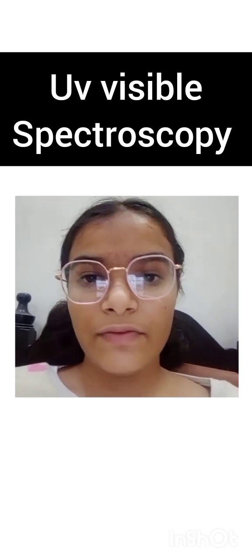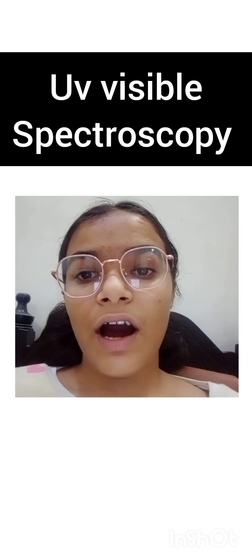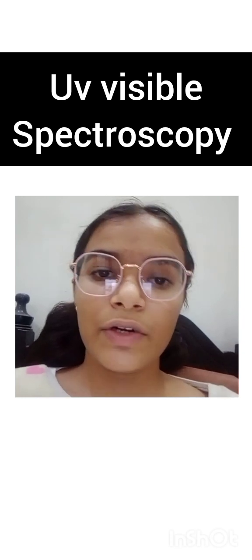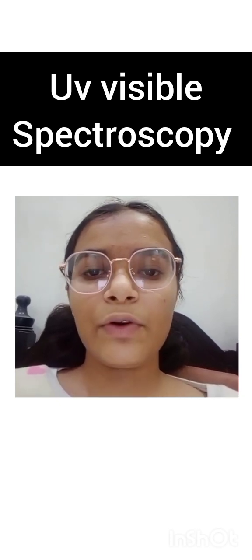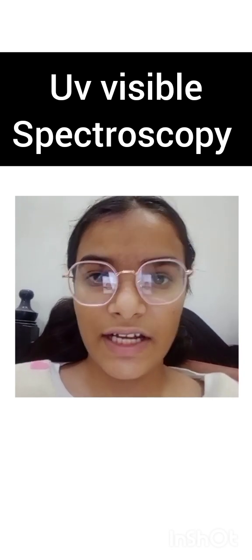Now we will discuss about the bathochromic effect, which is also called red shift, a shift to longer wavelength, lower energy, and hypsochromic shift, which is blue shift, a shift to shorter wavelength, higher energy. Hyperchromic is an effect which increases the intensity. Hypochromic effect is an effect which decreases the intensity.